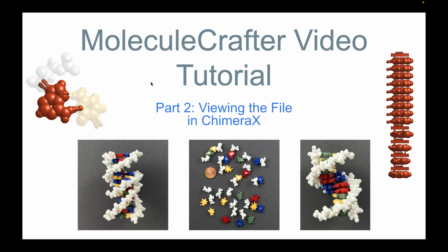Welcome to the second installment of the MoleculeCrafter video tutorial. Here we'll be talking about viewing the file in ChimeraX.